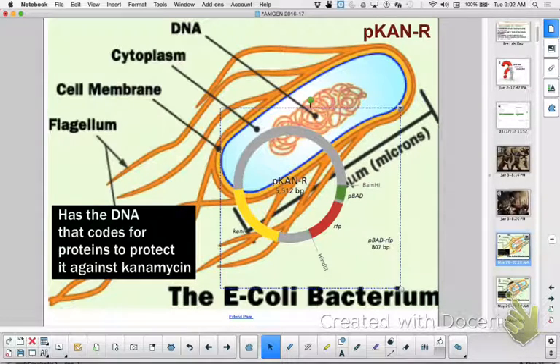And what you're really trying to do as genetic engineers is to cut this sequence out and go put it somewhere where we can get it expressed. You know where we could go put it? Yeah, go put it into our other plasmid, and once we do that, then we can turn the gene on with some arabinose and start making this red fluorescent protein. Now I'll explain that some more later. I'm just kind of opening your brain to that at this point.